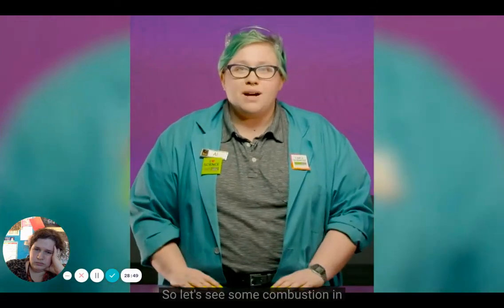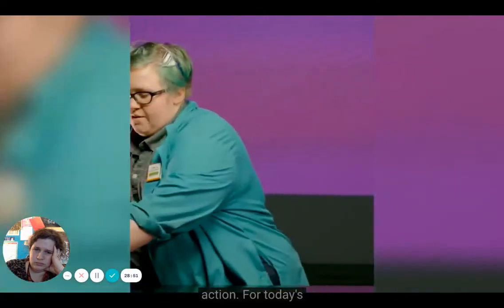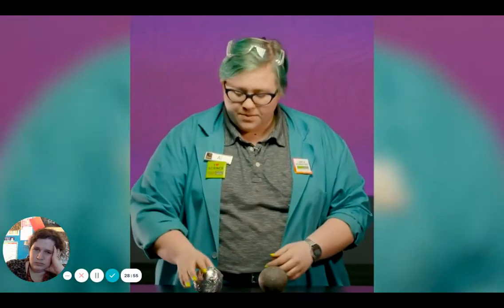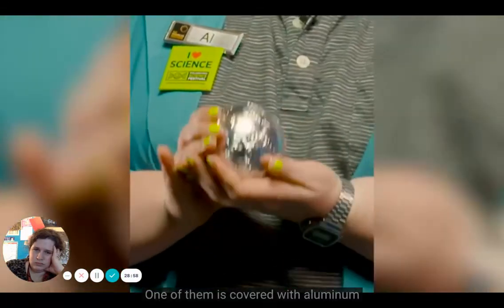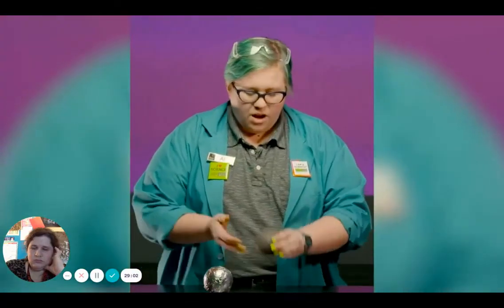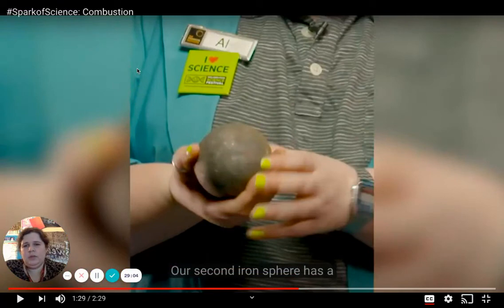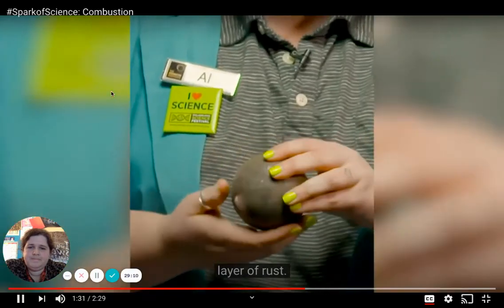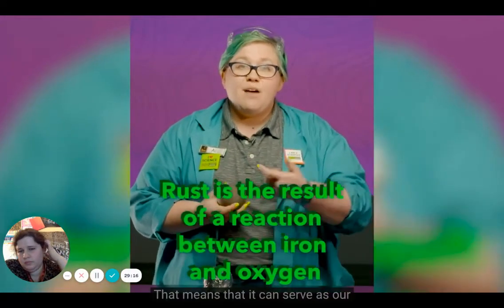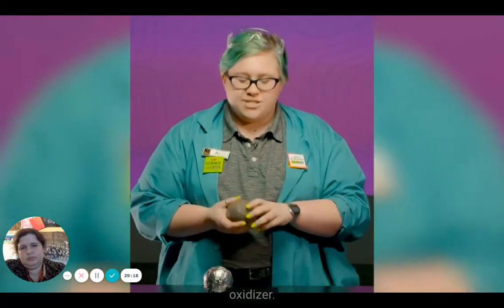So let's see some combustion in action. For today's reaction, I have these two iron spheres. One of them is covered with aluminum foil. The aluminum foil will be our fuel. Our second iron sphere. So in this case, she does not have a hydrocarbon. She's using aluminum instead. Has a layer of rust. The chemical name for rust is iron oxide. Iron and oxygen. That means that it can serve as our oxidizer.